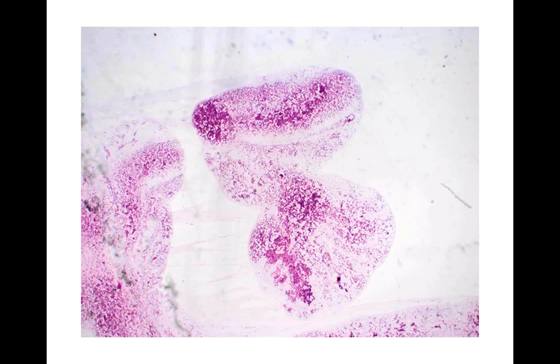So, I like pituitary adenomas for two reasons. First of all, they tend to be a lower grade tumor. The outcomes tend to be kind of good, especially compared to a glioblastoma. But also on an intraoperative preparation, it's really easy to do. I don't even have to do a smear. I don't have to take the tissue and smear it on a glass slide. I can just take the tumor tissue and touch it onto a glass slide.